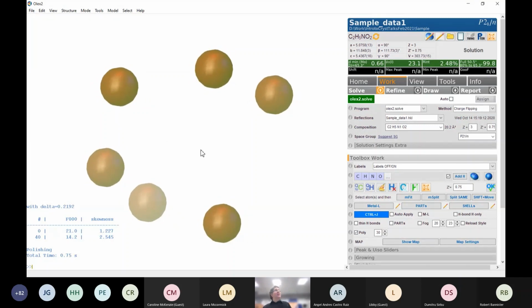Now, you probably don't see it, as this looks absolutely nothing like the structure of glycine, and I would agree with you, but what are we actually seeing there? Each of these brown spheres represents an area of high electron density. If I hover over a sphere, you'd get a little window telling me what it is, although it's not showing up on the screen.